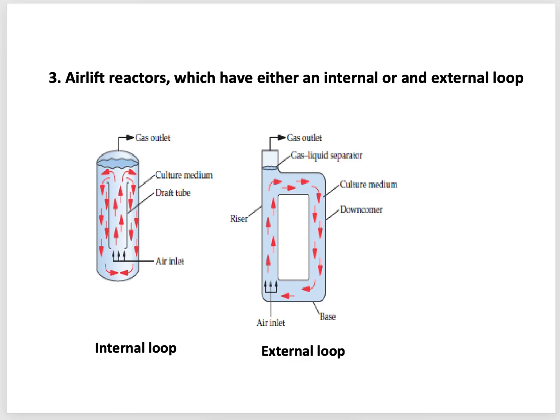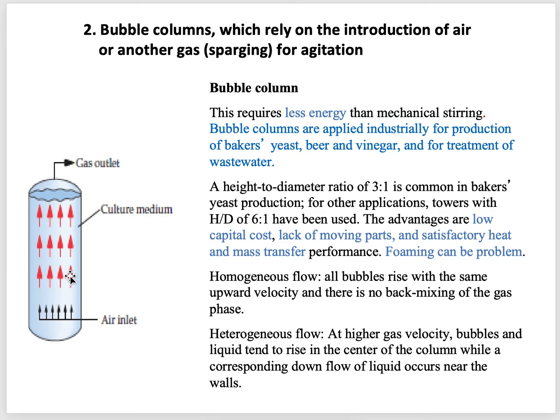So think about this one, the bubble column. We are injecting the oxygen, air, that means oxygen. Bubbles are formed here and they go upwards. So by this time, the gas disengagement should be done within this time.